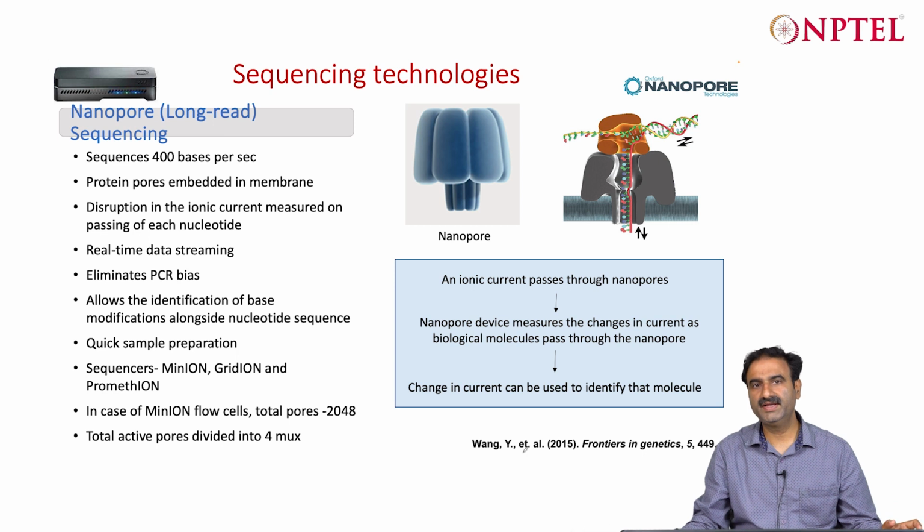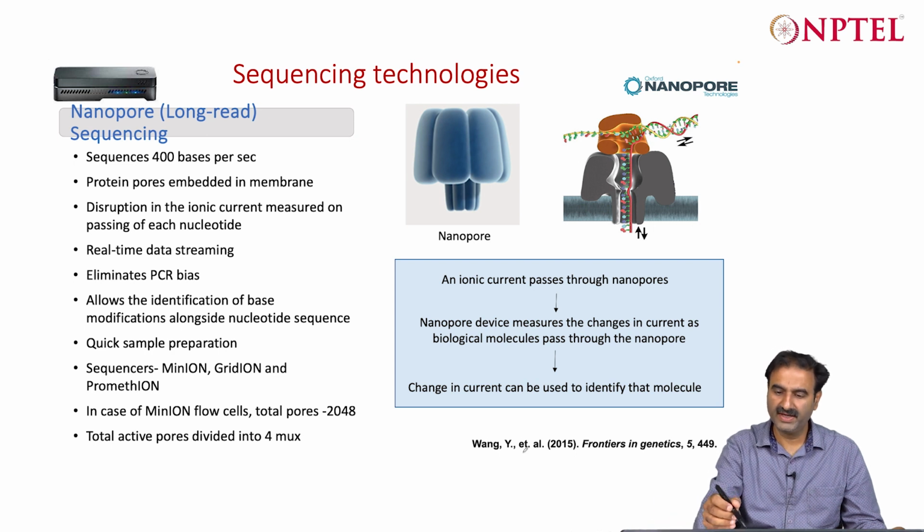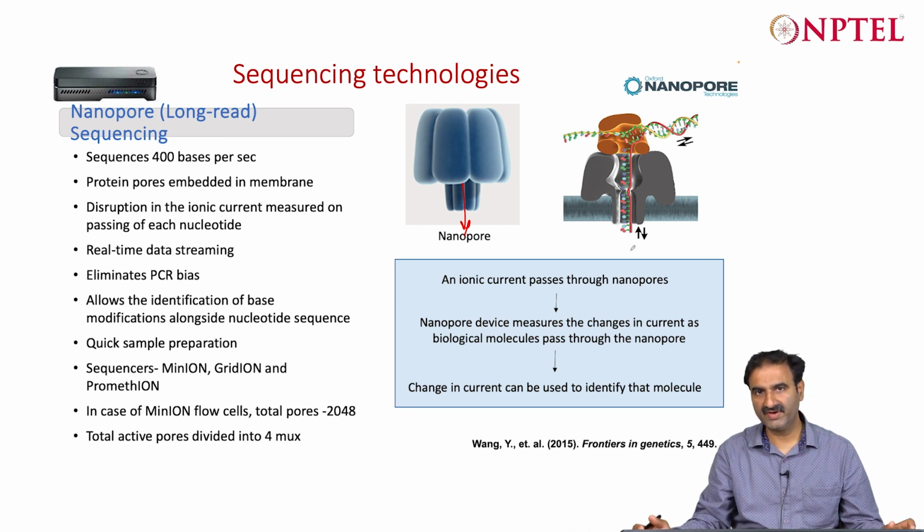Then we looked at another long read sequencing technology, which is very friendly to smaller labs and lets you sequence larger genomes: Nanopore sequencing. Here you can see a nanopore through which the DNA passes. As DNA passes through the pore, it disturbs the current that was built up by the flow of ions.